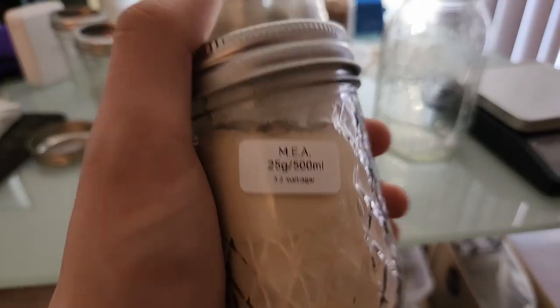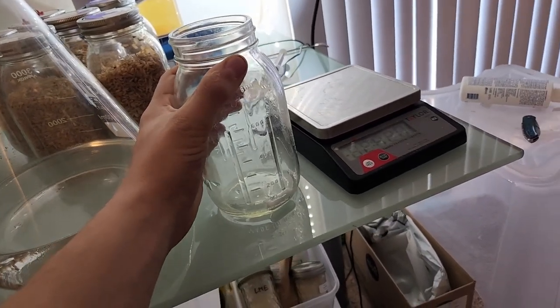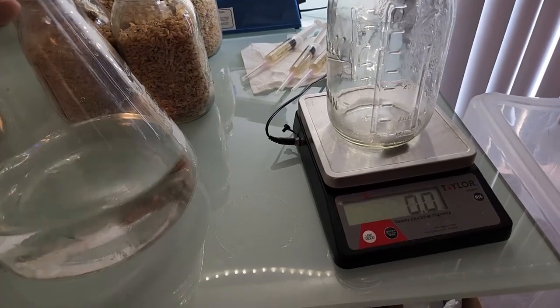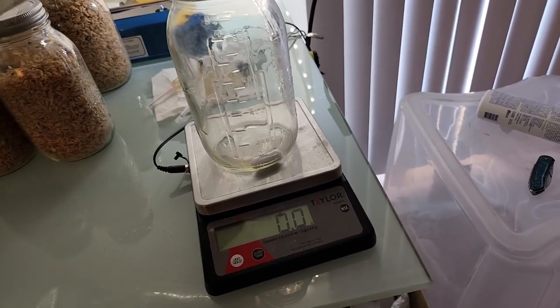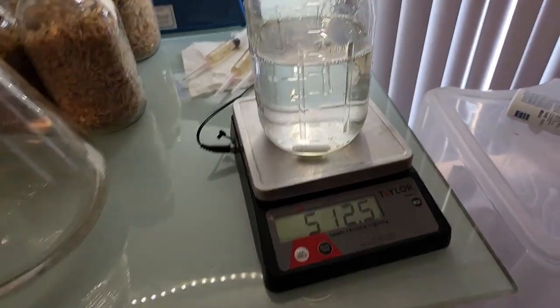Once you have your malt extract agar all mixed up, you're going to want to grab some cold water. You don't want to use warm water, and a container that you can weigh it out in. You can also go volumetrically. 1 gram of water is 1 milliliter, but weight is more accurate. So go ahead and tear it out. I'm going to be making a 500 milliliter recipe, so I'll weigh out 500 grams of water. It's alright to go slightly over because you're going to bring it to a boil and probably lose some.